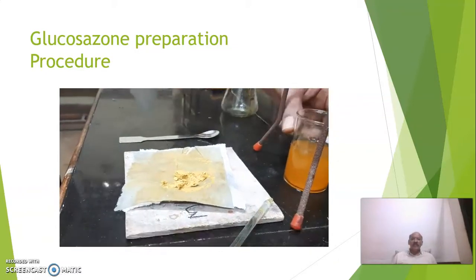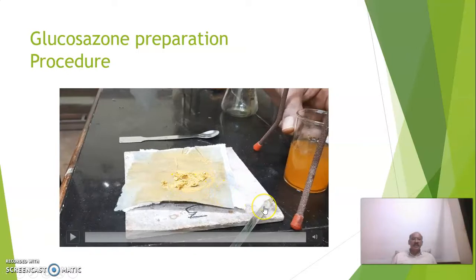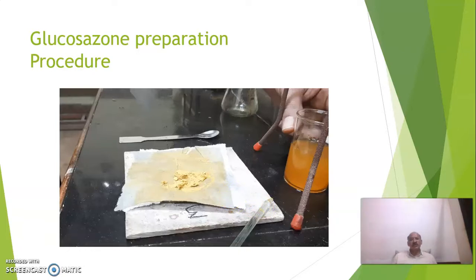Then in hot condition, by using cotton plug, we have to do filtration where insoluble impurities will remain on cotton plug, and filtrate obtained that will give you crystals of glucosazone on cooling.